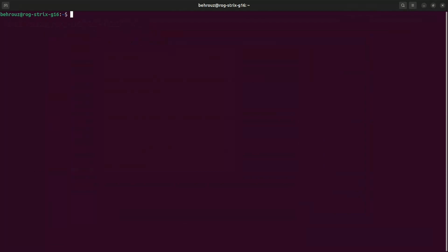Let's create a new folder and change the directory to this folder.